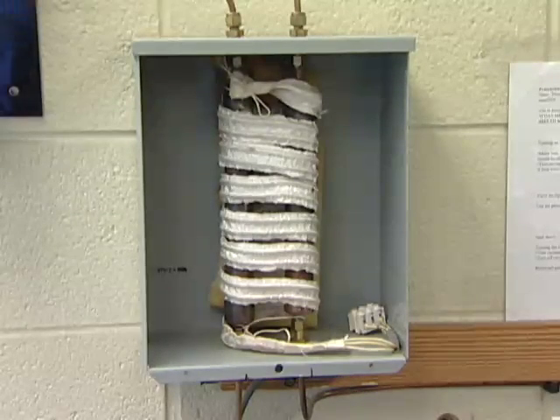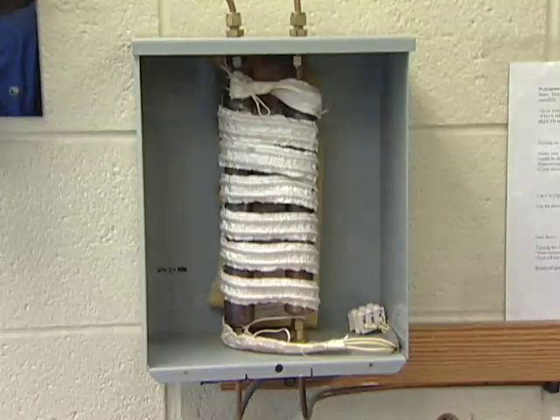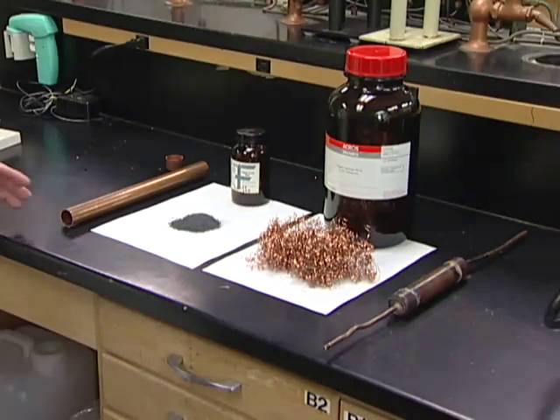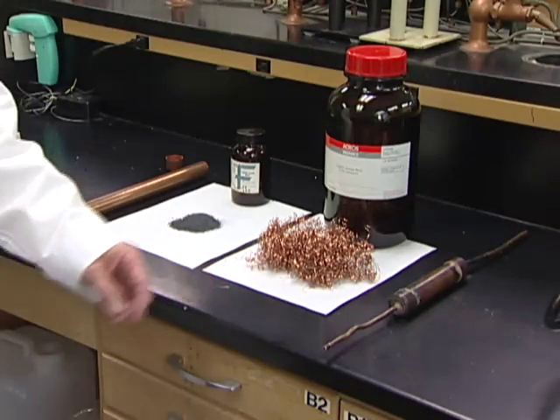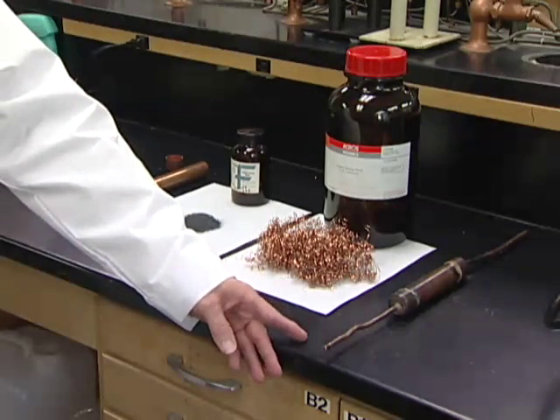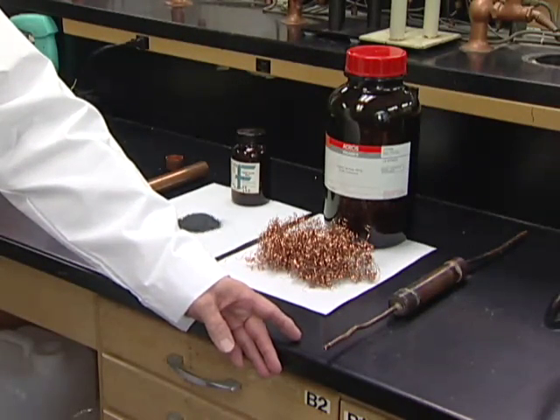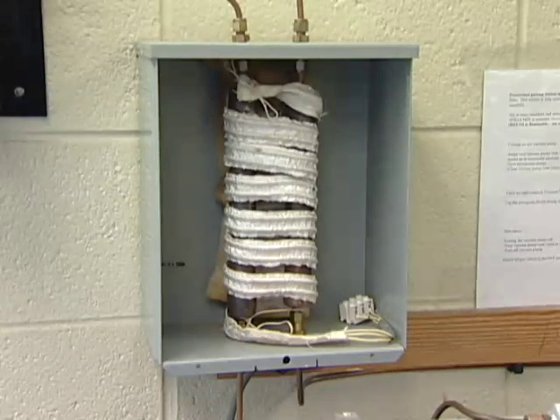The next component of the gassing station is an oxygen scrubbing column. The heated copper-filled column removes contaminating oxygen from the gas supply. It consists of large copper tubing approximately 25 millimeters in diameter, filled with copper filings or copper metal light turnings. Copper in this form provides a large amount of surface area. The end caps and tubing are attached with silver solder or some other type of solder that can withstand high temperature. The column is wrapped with a flexible heating tape suitable for use on metal at high temperatures and then covered with insulation.